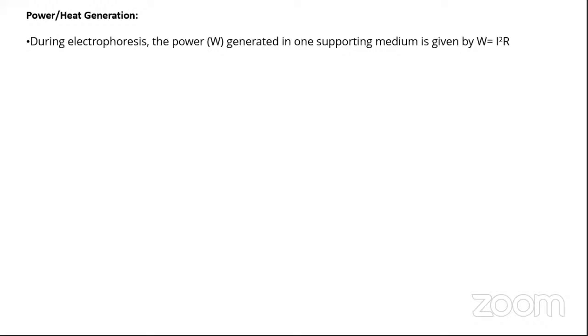Now imagine this situation. I have given this relation also for you. It will be slightly complicated now because we are considering several things at a time. Quickly, can you tell me: if by hook or crook I increase the temperature of the medium in which electrophoresis is carried out, what will happen to resistance?